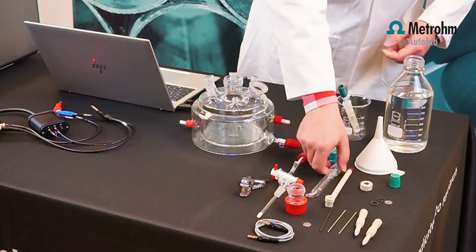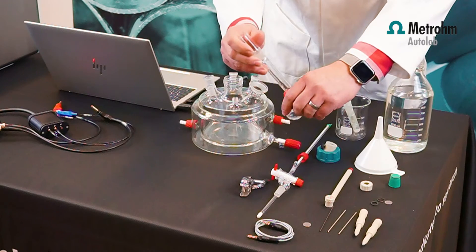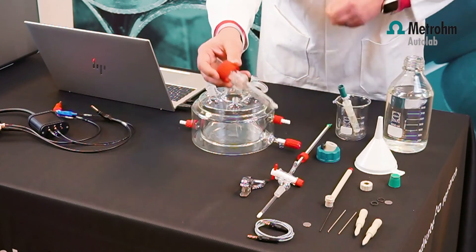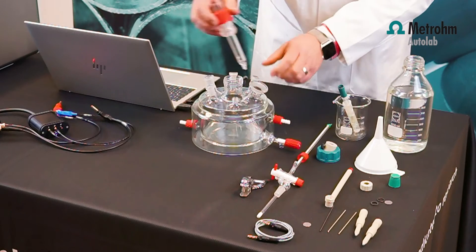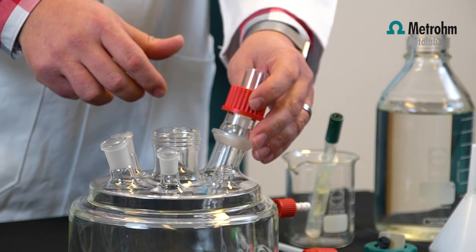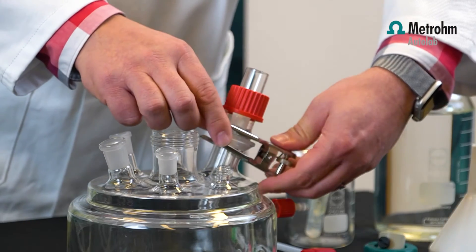The Luggin capillary is fitted with a spherical ball joint, so you can just insert it. You can put it into position in the corrosion cell.